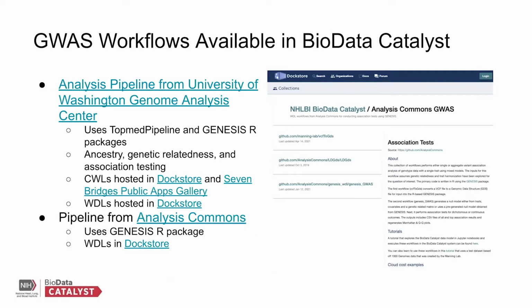Some GWAS workflows that are currently available are showcased in the BioData Catalyst organization on Dockstore. This includes an analysis pipeline developed by the University of Washington Genome Analysis Center that leverages the TopMed pipeline and Genesis R packages. This includes workflows for ancestry, genetic relatedness, and association testing.